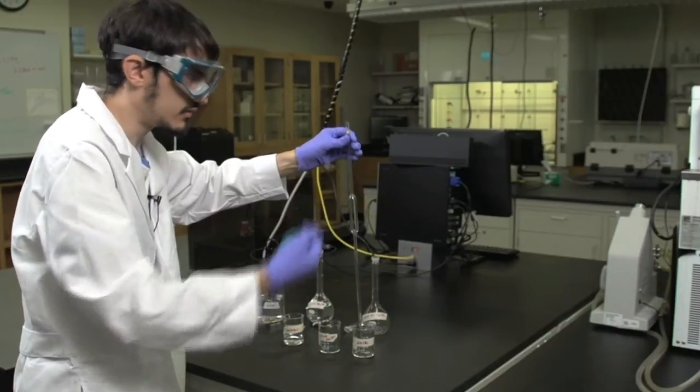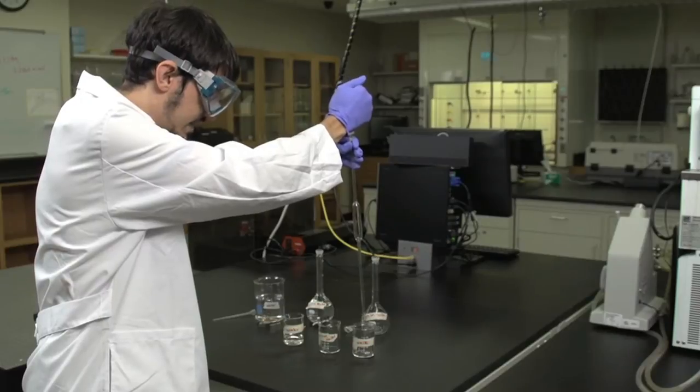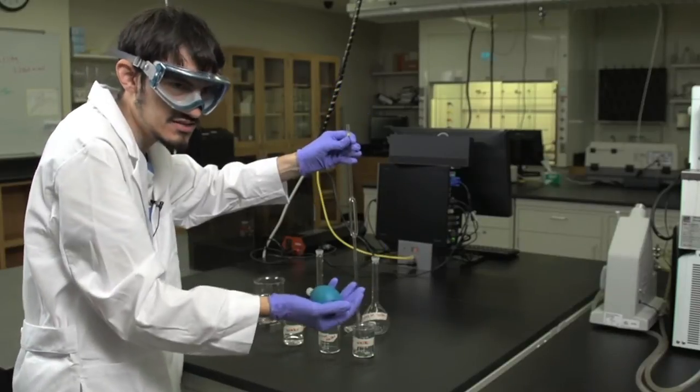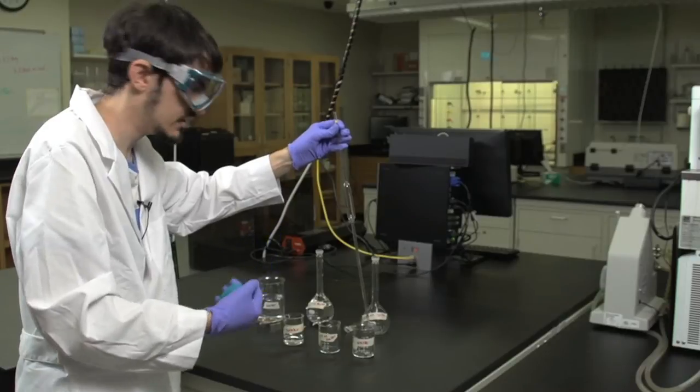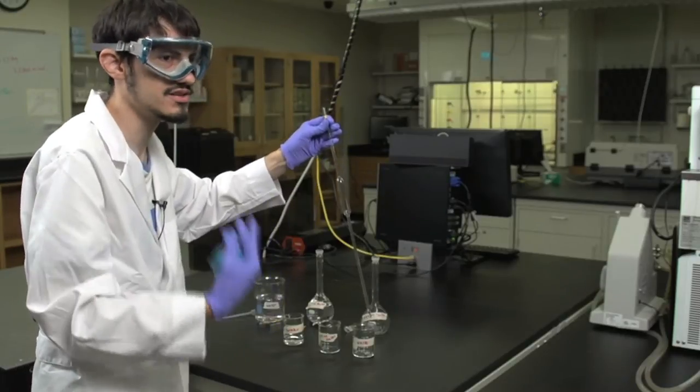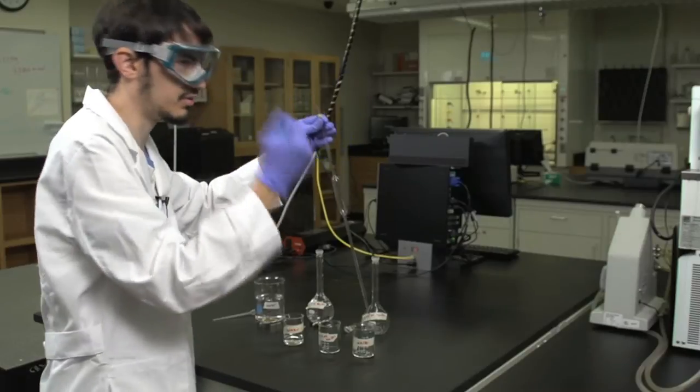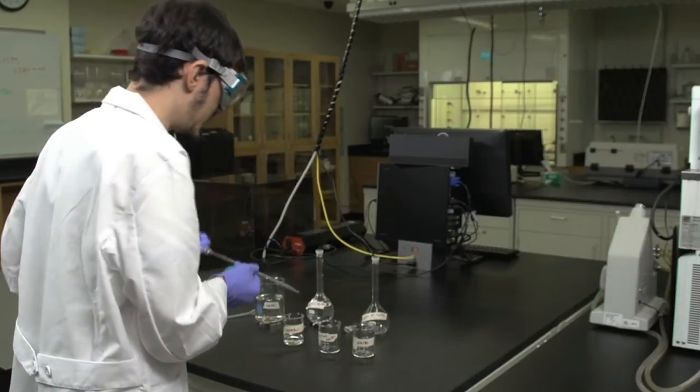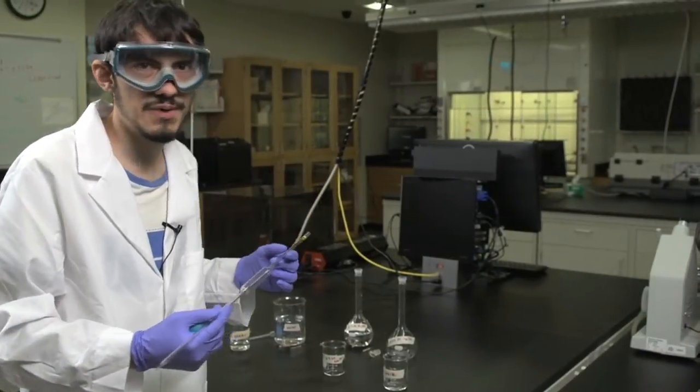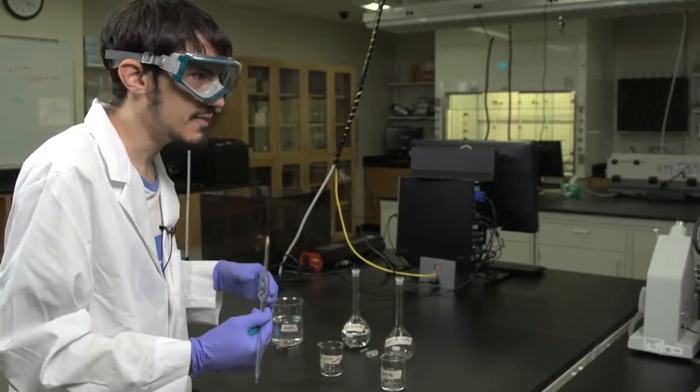Allow the water to drip out into a waste container. You can also blow out the remainder in this case, but do not do this when you are making an actual solution, as the pipettes are calibrated to deliver the amount of volume without having to blow out the remainder. Once you have rinsed the pipette with water, you are now ready to make the solution.